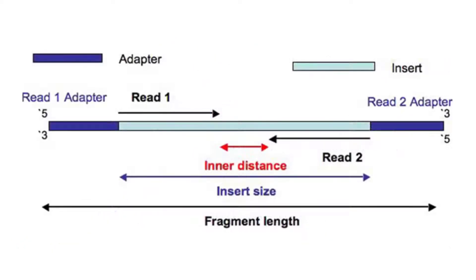One of the parameters that can be set is the insert size. This is the size of the fragment between the sequencing adapters, so it is the distance between the start of your actual sequence and the end of that sequence. Sometimes you will hear people refer to this as the fragment length, but that is incorrect, because the fragment length includes the sequencing adapters. The inner distance is the distance between the ends of both reads.